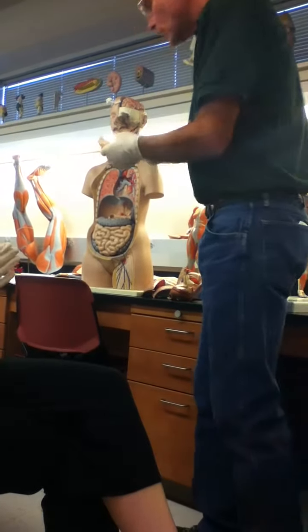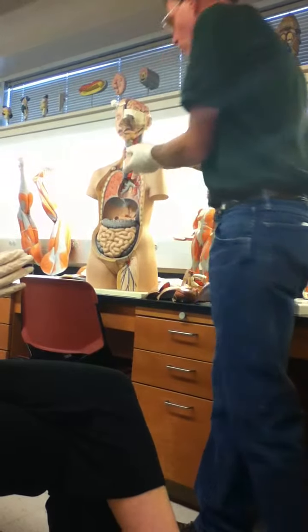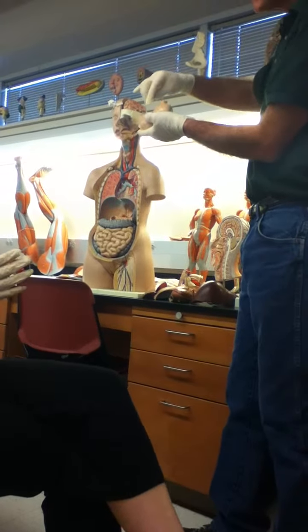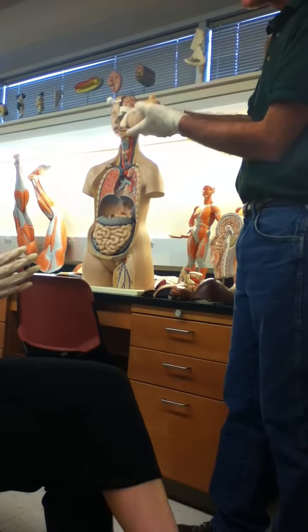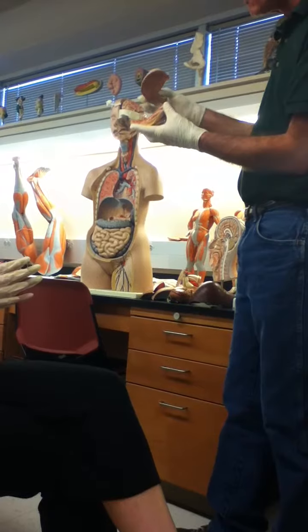Okay? Here's the stomach. The stomach goes like that. So your esophagus would hook up here. That's the cardiac region of the stomach, named for the cardiac sphincter valve you'll find inside, but don't cut up the cat.